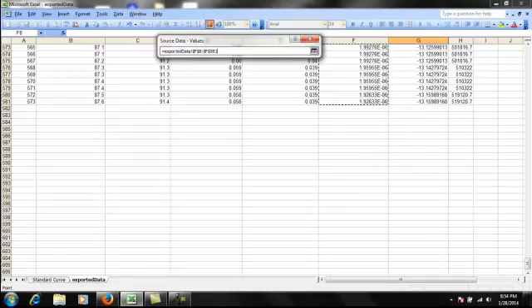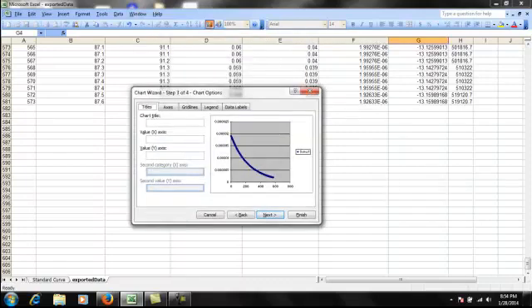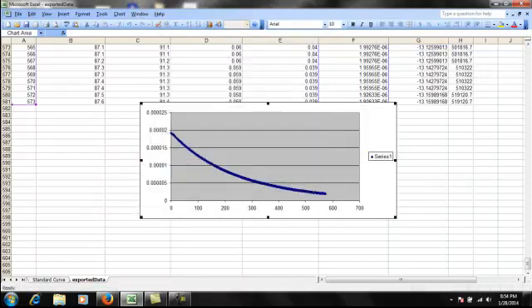Okay, there we go. We're going to go back. It's going to be a preview there of the graph. Look at that. We got a whole lot of nice data points. Okay, and then you guys can go in there and add your titles and all that sort of thing. I'll let you do that, but there we go. There's my graph there. Okay, so that ought to tell you something. There's a free hint for those of you who have watched the podcast here.